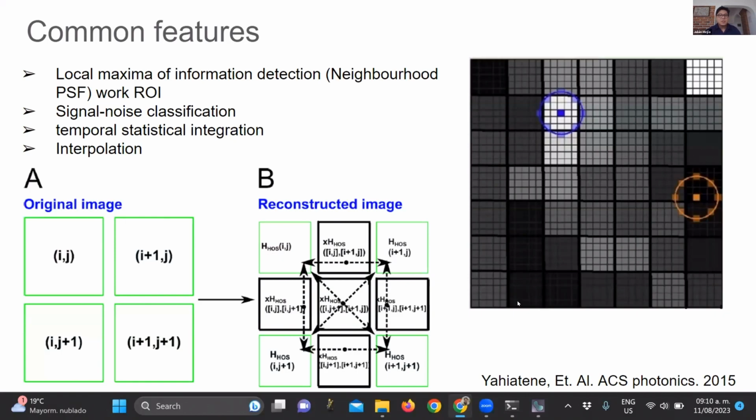But the basic one, I would say, is confocal microscopy. The fluorophores that you can use with confocal microscopy, you can apply to this technique. But a little bit of a spoiler of the presentation, there is one technique that might not need this requirement, so I will show this. And autofluorescence has fluctuation, but probably in your analysis it will be regarded as noise.